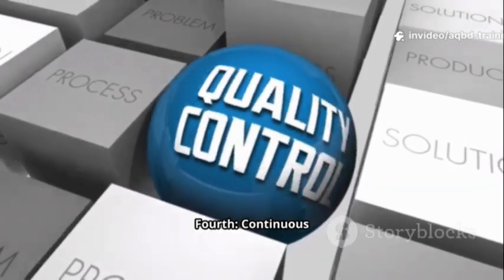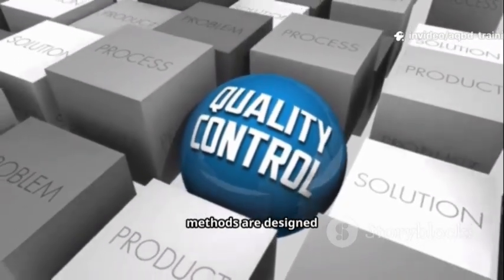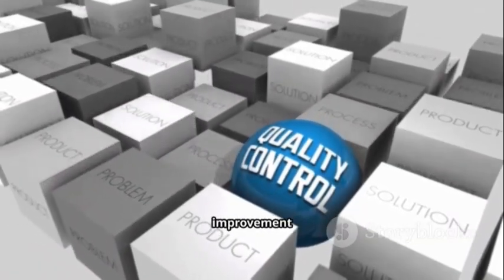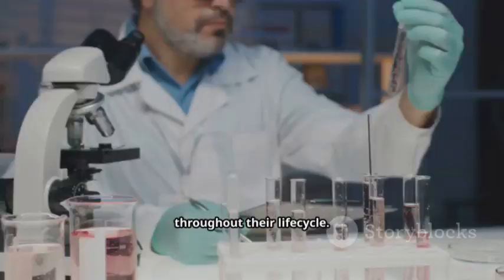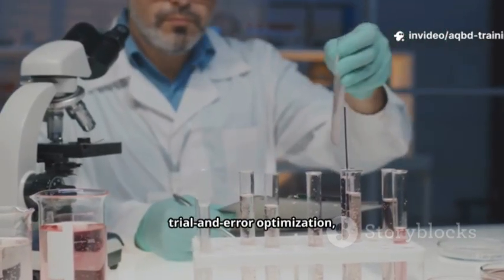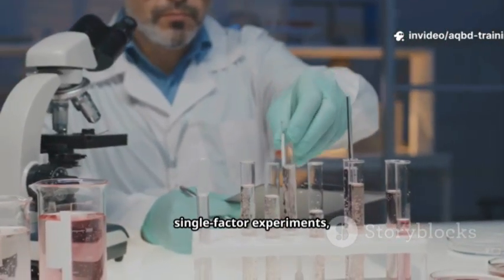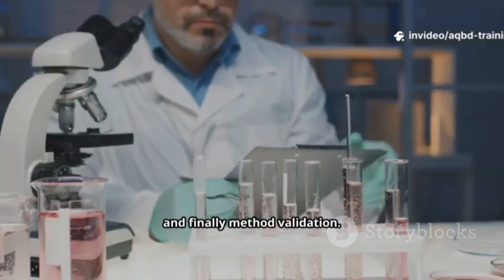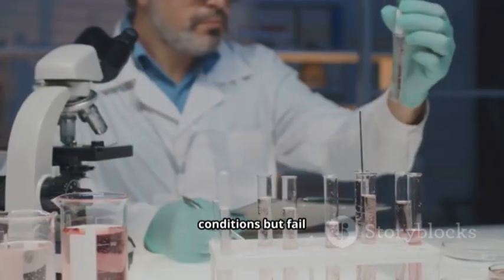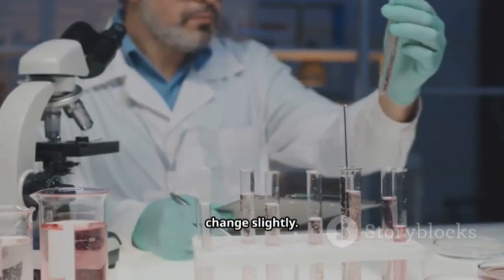Fourth, continuous improvement. AQbD methods are designed to be robust and include mechanisms for ongoing monitoring and improvement throughout their lifecycle. The traditional approach starts with literature review, followed by trial-and-error optimization, single-factor experiments, and finally, method validation. This often results in methods that work under specific conditions but fail when conditions change slightly.